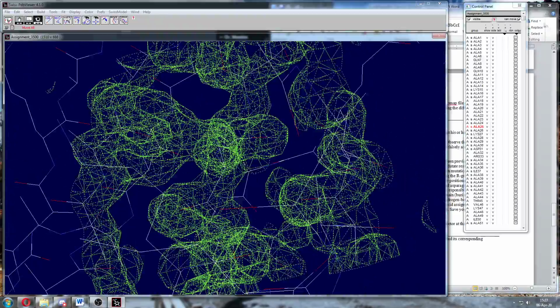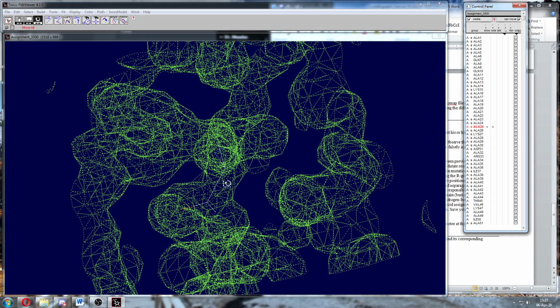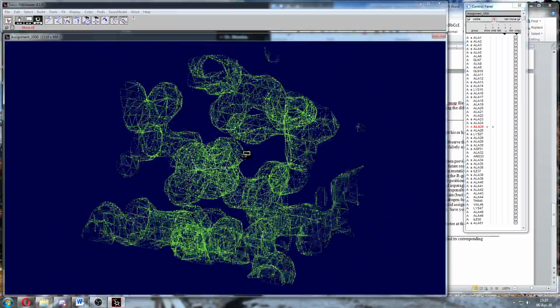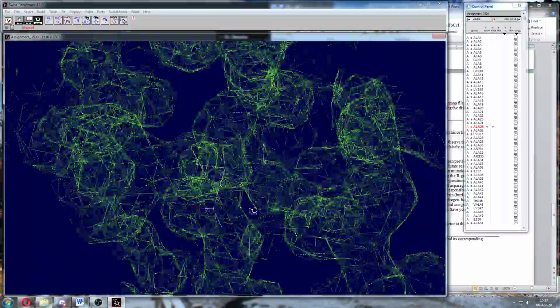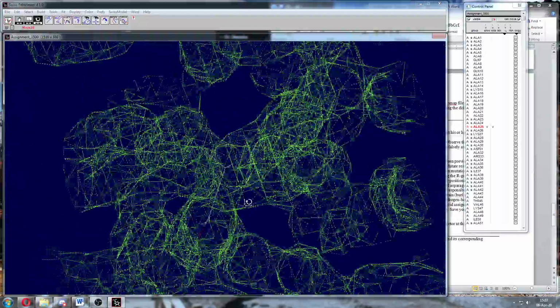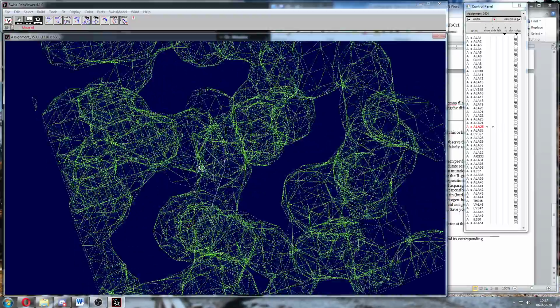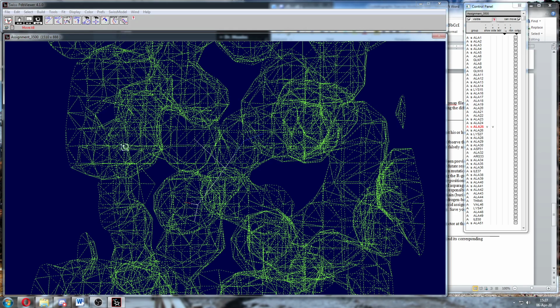If you want to clean up your image, you can remove all the other side groups and everything and just leave that one. It might make it easier to see. Now all I see is that one amino acid. It looks like there's something bigger. If it were alanine, this sphere right here would just continue around as a sphere, and there wouldn't be any of this other density over here. So it clearly looks like there's something else, maybe a big ring out here. Let's try putting something out there that would fit.